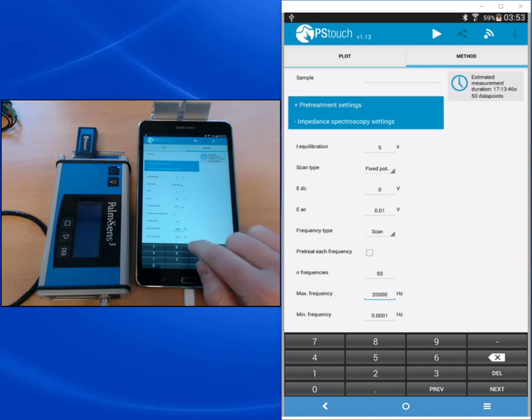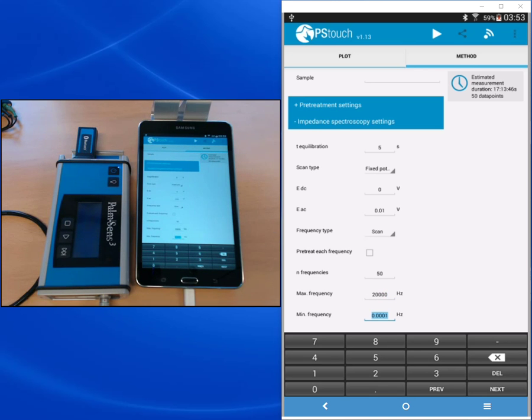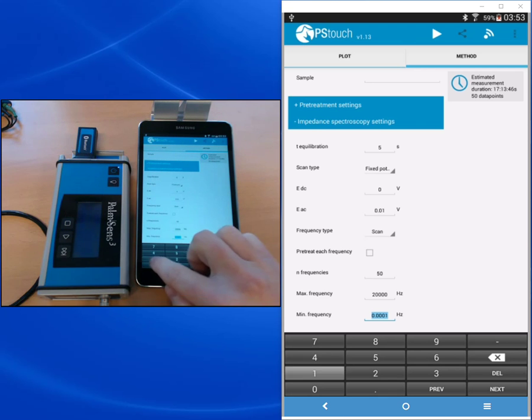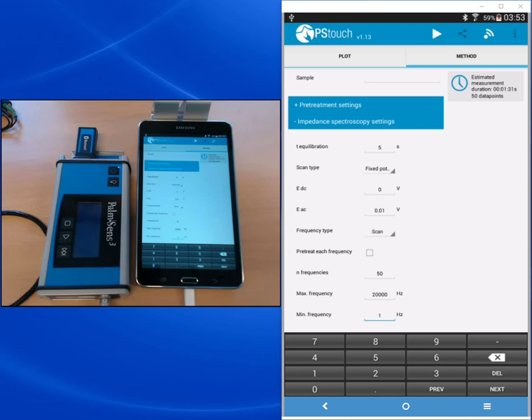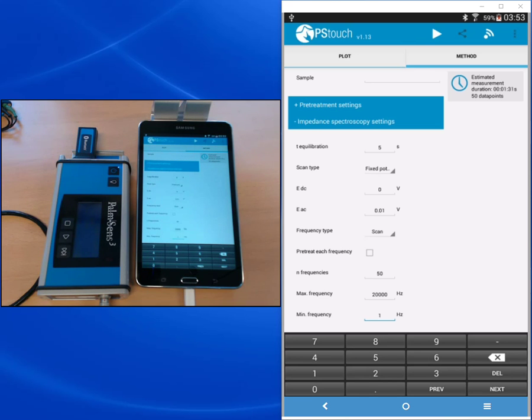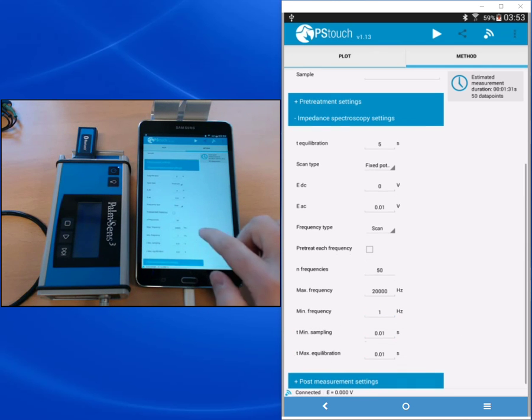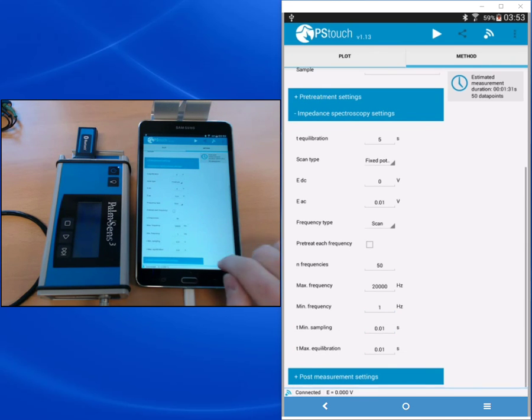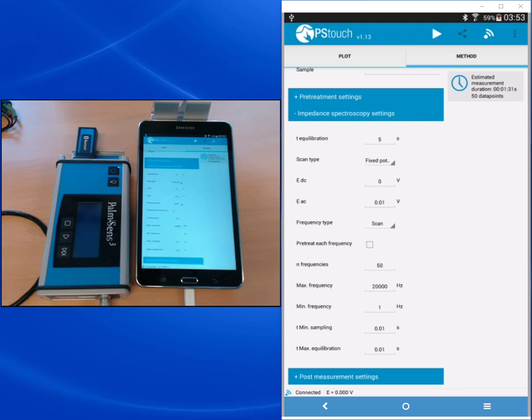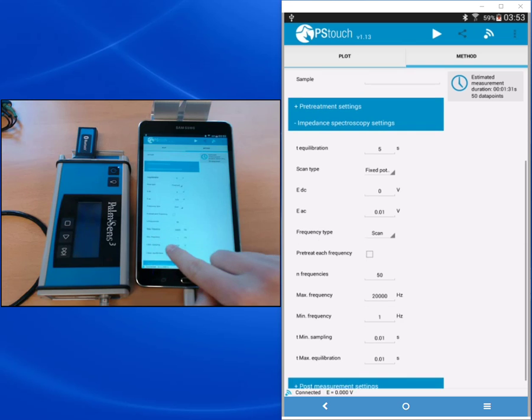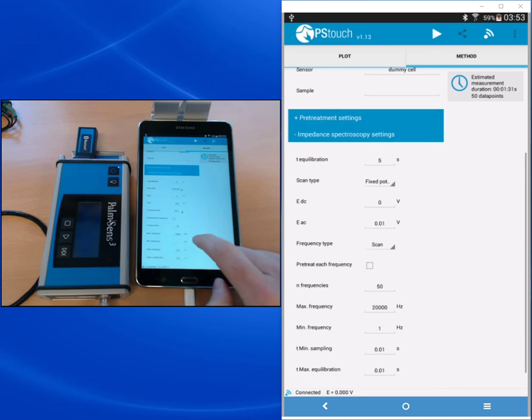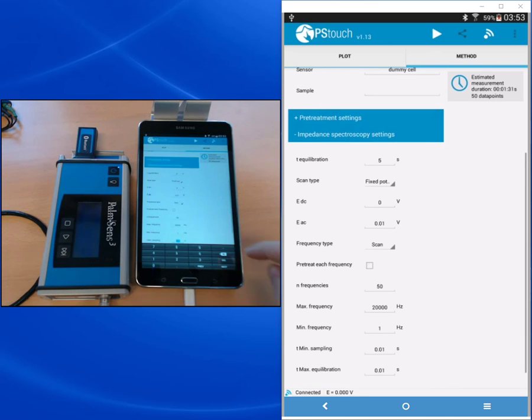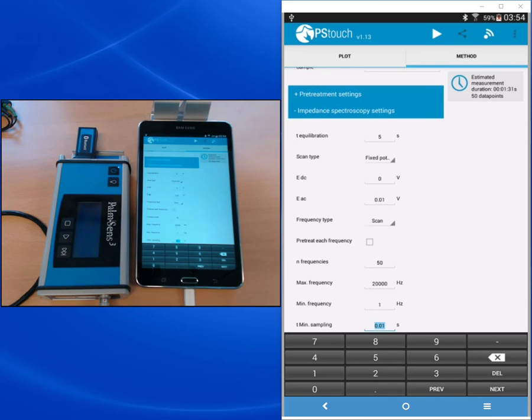The minimum frequency that the Palmsense can handle is 0.1 millihertz. We don't need to go that low. We will just choose one hertz. Because as lower the frequencies go, the longer the measurement will take. With one hertz, one sine wave takes one second. With one millihertz, one sine wave takes a thousand seconds. So we're choosing one hertz.